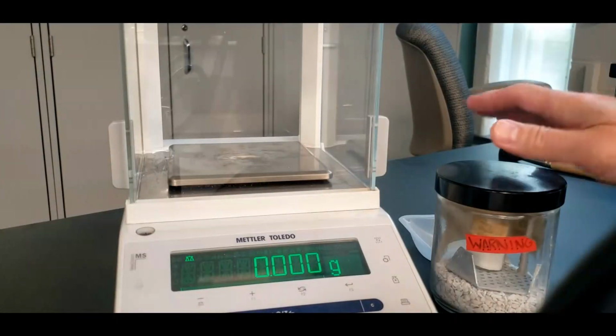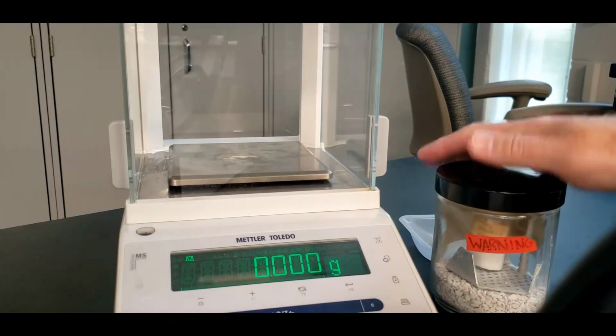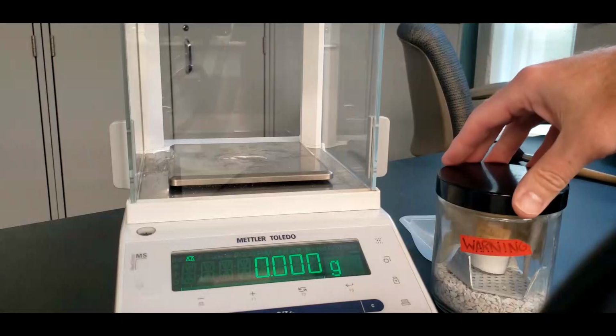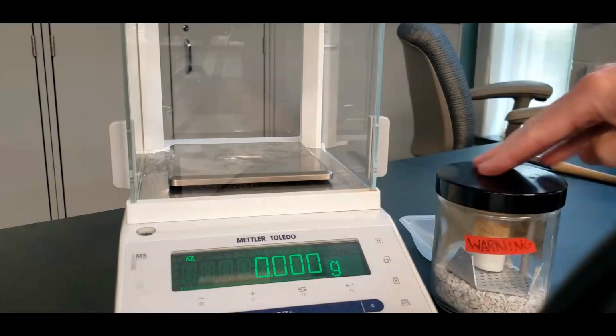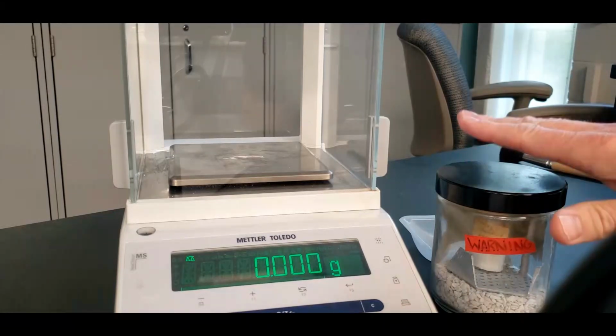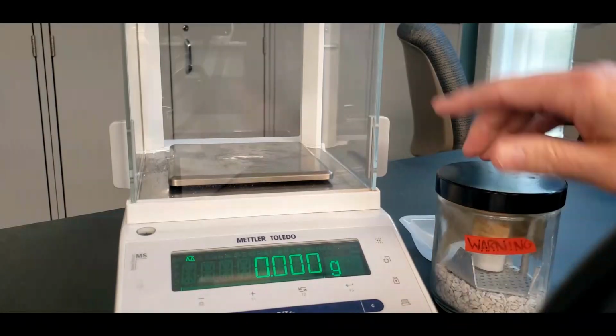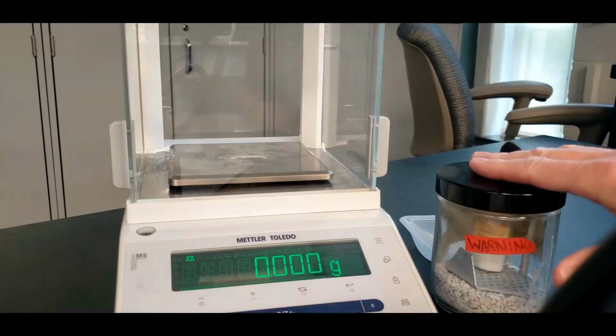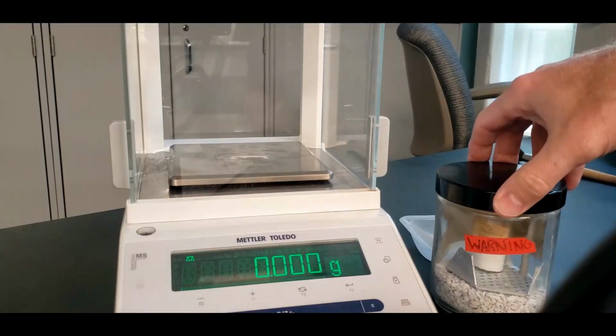So for the next 3 samples, we need the KHP, which is potassium hydrogen phthalate. It is an acid, but it's a solid one. And we keep it inside this desiccator to keep the water out of it, because we want it to be completely dry. So whatever mass of potassium hydrogen phthalate we see on the balance is all due to just the KHP, not to any water that it's absorbed.